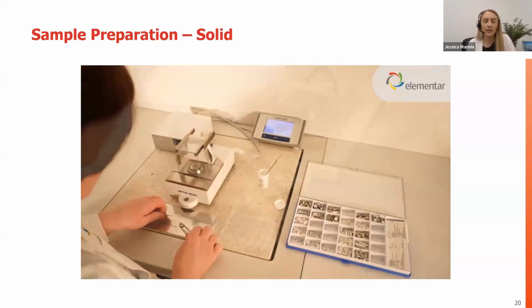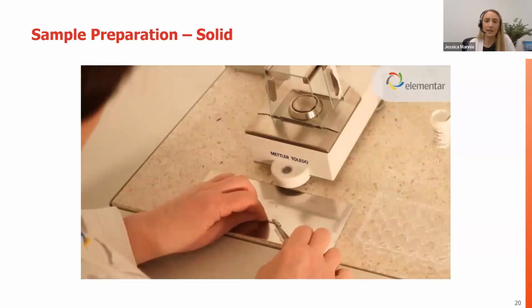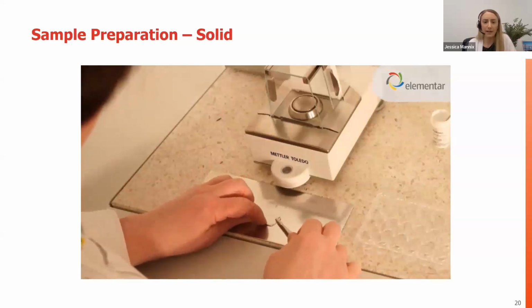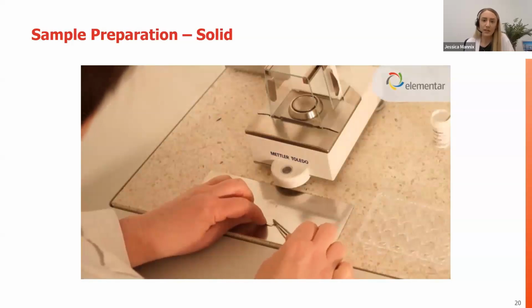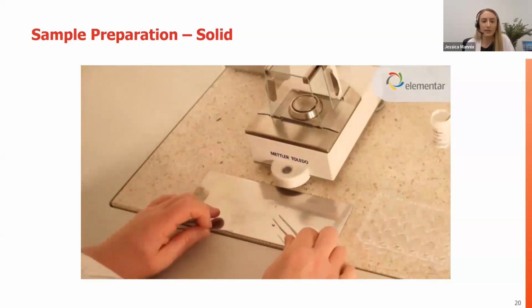Silver we'll use in pre-acidified samples because the tin, of course, would decompose. And if we have a sample that isn't burning very well, we can wrap it again in tin. So what you see here is she takes the empty tin, she puts it on the balance, tares the balance, adds the sample, and closes it up. So in terms of overall steps, it's very easy.